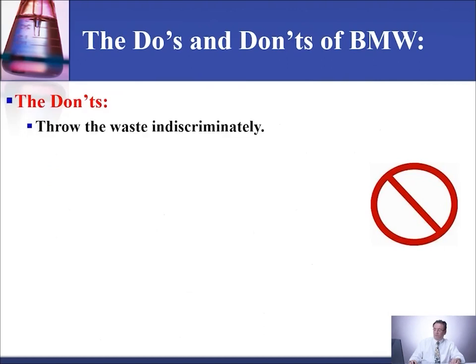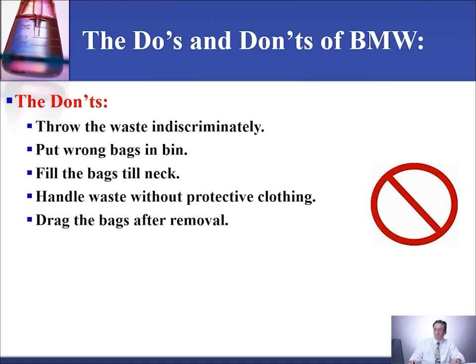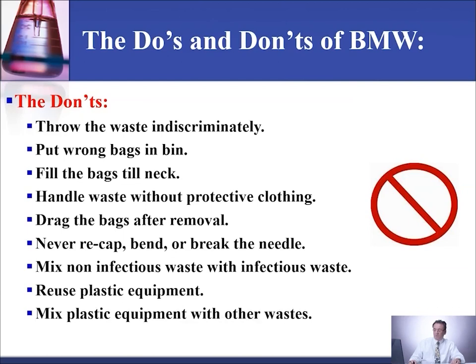The don'ts of biomedical waste. Don't throw the waste indiscriminately. Don't put the wrong bag in the bin. Don't fill the bag to the neck. Don't handle waste without protective clothing or equipment. Don't drag the bag after removal. Don't remove, recap, bend, or break the needle. Don't mix non-infectious waste with infectious waste. Don't reuse plastic equipment. Don't mix plastic equipment with other waste. Don't burn waste.